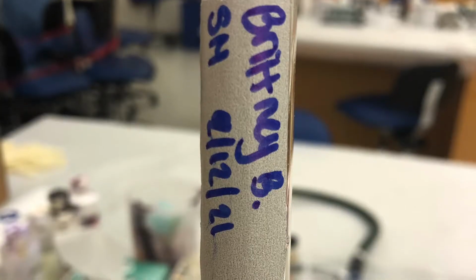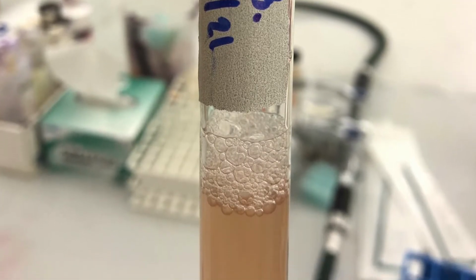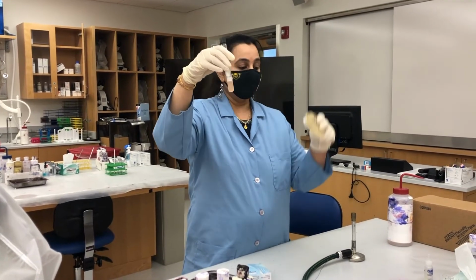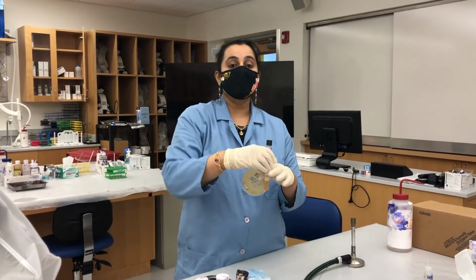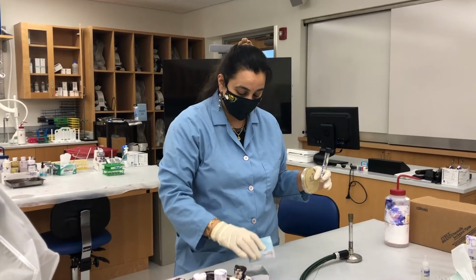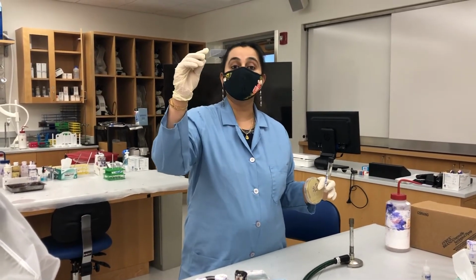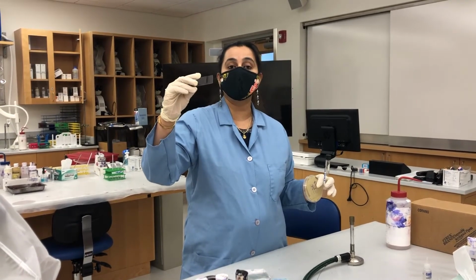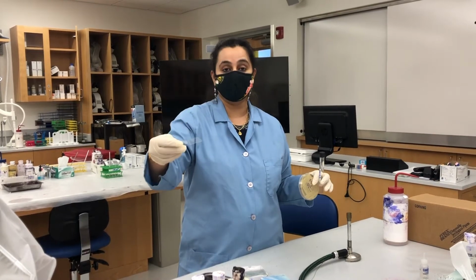So this is Serratia marcescens, I believe, growing in the tryptic soy broth. So you can either use solid culture or liquid culture and add those cells on these microscopic slides. Okay, so this procedure is known as making a bacterial smear and making this ready for your gram staining procedure.